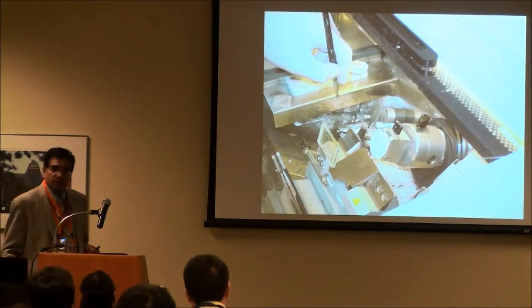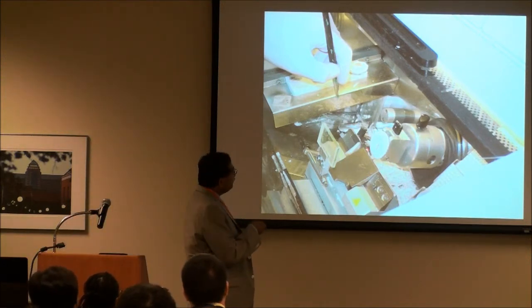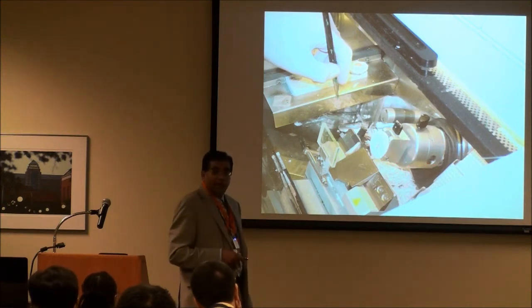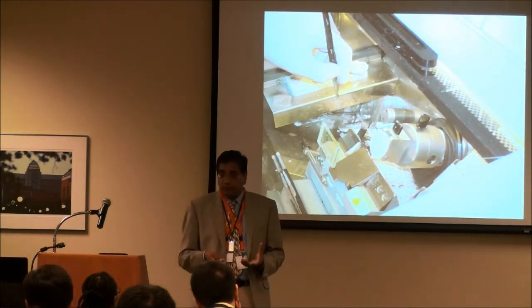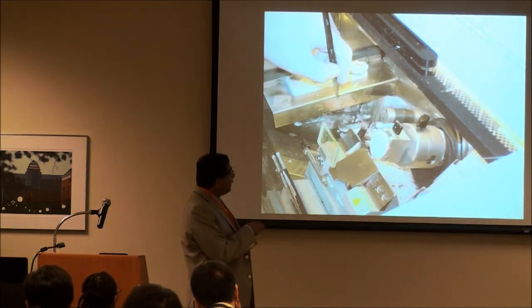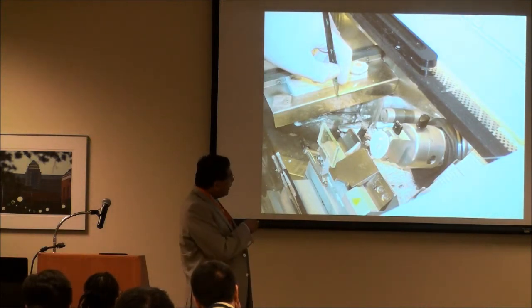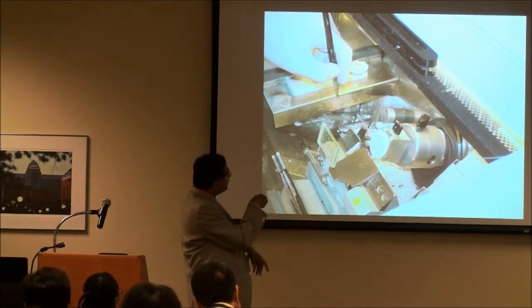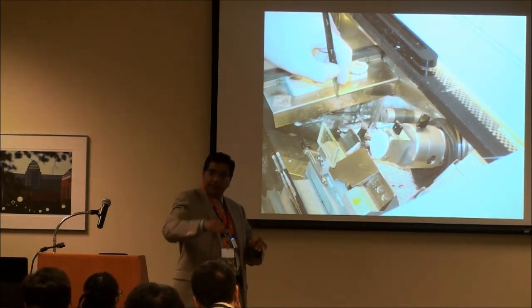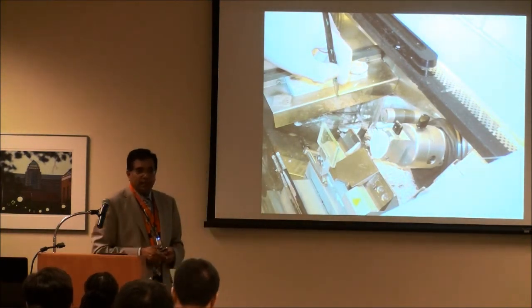During frozen section, the tissue is fresh. It's freshly frozen. And if it is from a lung, a portion of lung, and the doctor doesn't know if it is tuberculosis or a fungal infection, then at that point this is infectious because it can aerosolize. At that point, yes, you can wear a mask. But usually this cryostat has a little bit of cover on it. When you cut it, the risk is low. But yes, you can wear a mask at that point.